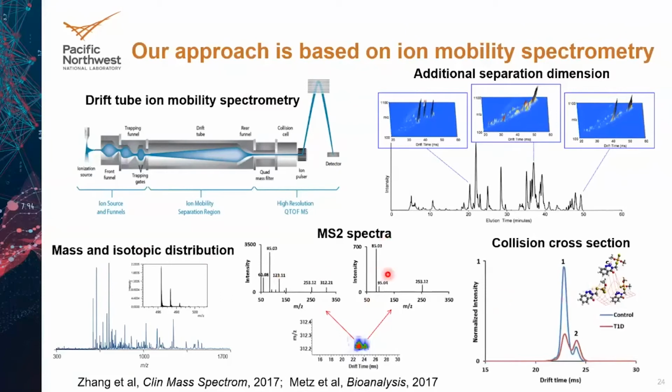And I will mention also that ion mobility has a nice ability to separate isomers and isobaric compounds that liquid chromatography and a mass spectrometer typically cannot. And so that's part of why you have increased dynamic range and coverage of the metabolome during measurements.